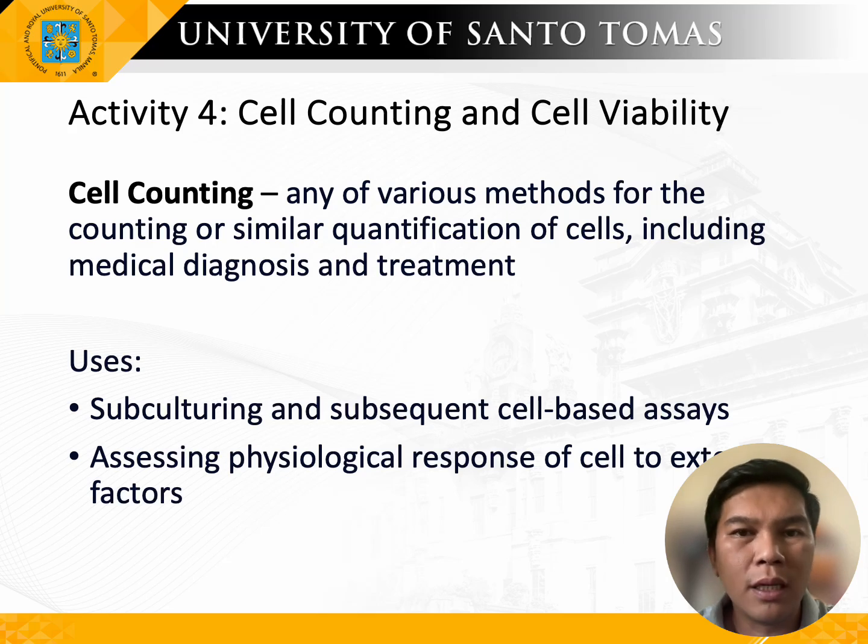Hi everyone. Today you are going to perform Activity 4, which is entitled Cell Counting and Cell Viability. Cell counting is defined as any of various methods for counting or similar quantification of cells, including medical diagnosis and treatment.